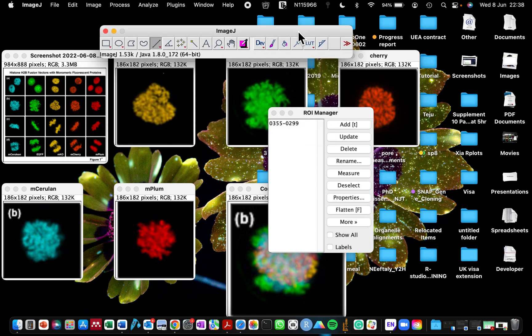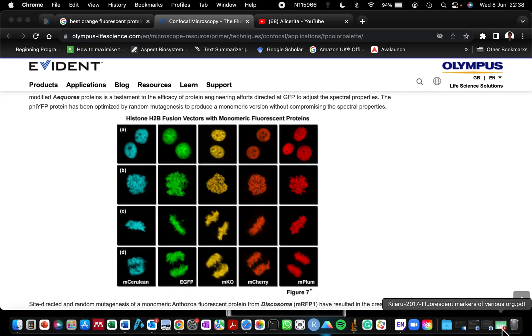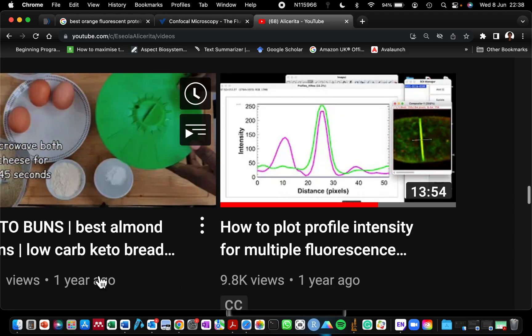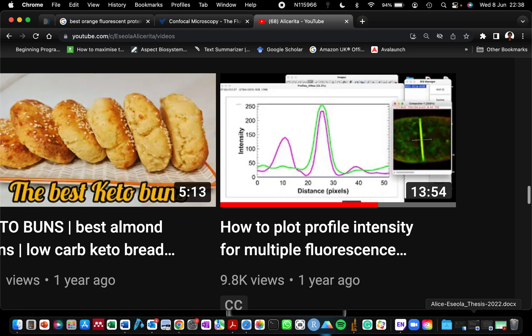In today's video I'm going to be describing how to make a profile plot for confocal images that have more than three fluorescence channels. Someone recently asked me in one of my videos. I have a video from last year where I showed how to make a profile plot for multiple channels — however, in that video I described how to do it for an image that has three fluorescence channels, and that approach cannot be used for a microscope image that has more than four fluorescence signals.